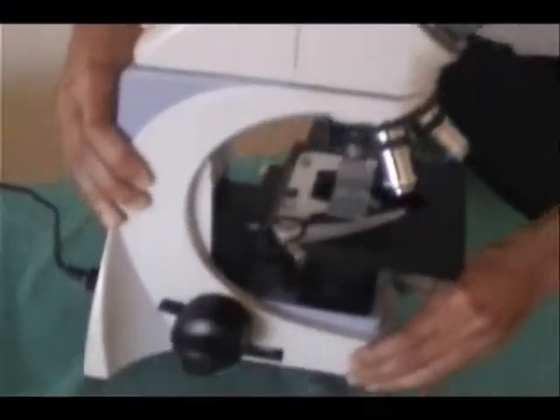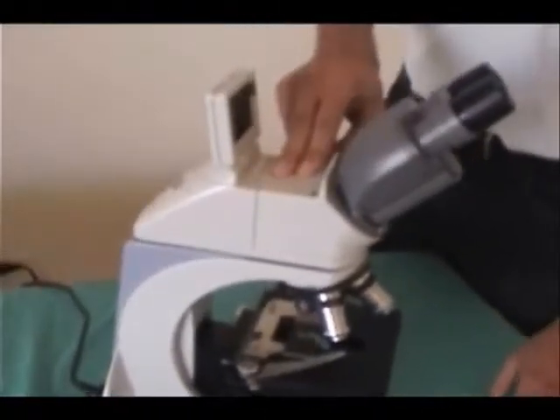A good thing about this microscope as well is the high quality manufacturing. It's actually going to give you a lot of stability on the research table. This is a very extremely stable microscope.